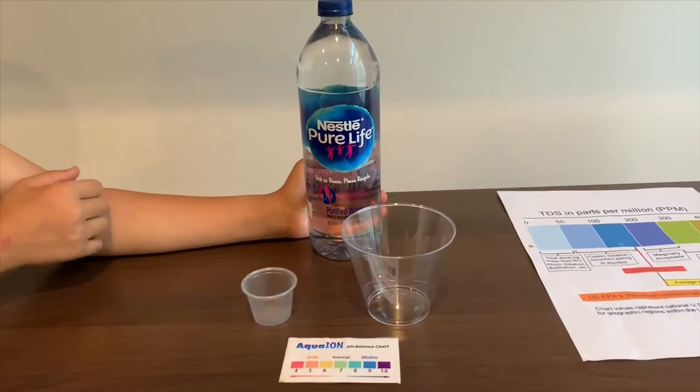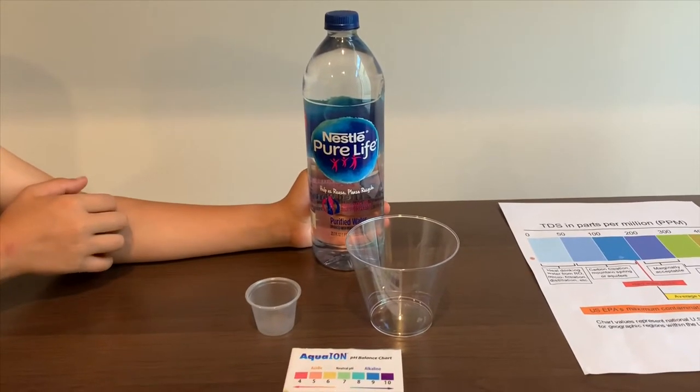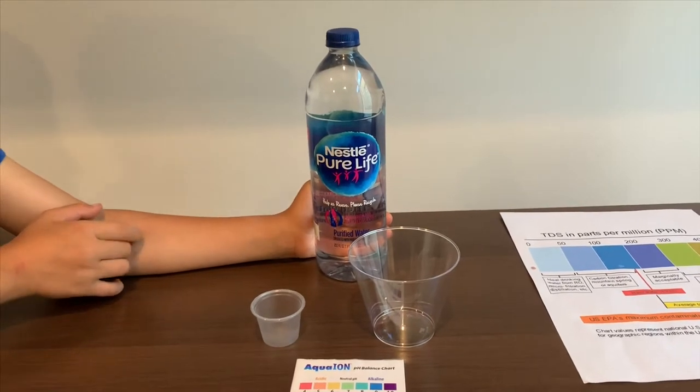This is Nestlé Pure Life Purified Water. We tested another version of this and its TDS was 60 and its pH was 7. Let's see how this one compares.